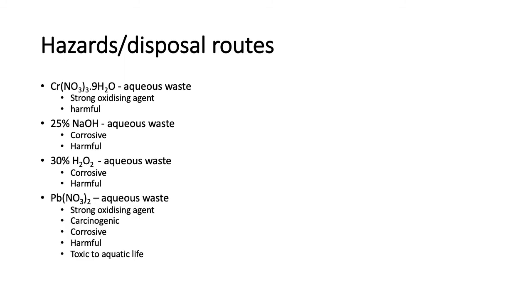Lead nitrate is a strong oxidizing agent, and it's carcinogenic, corrosive, harmful, and toxic to aquatic life, so wear gloves, dispose of it correctly. And then the chrome yellow is, obviously, carcinogenic and harmful to aquatic life, so you put it in the solid waste bin.